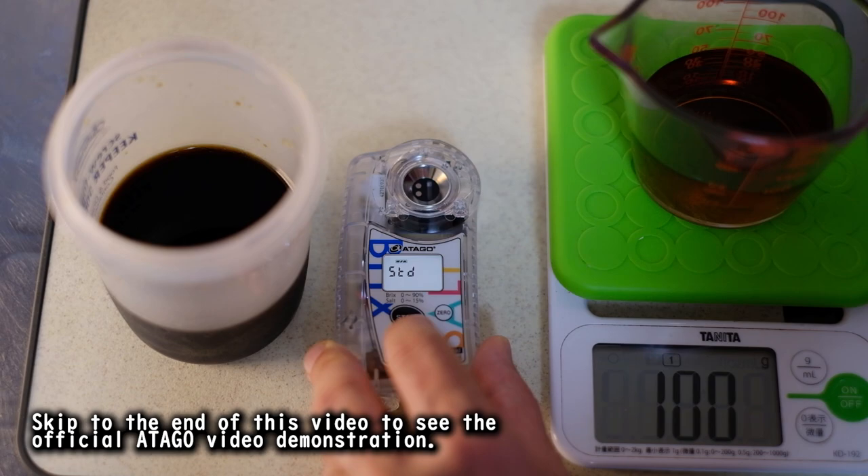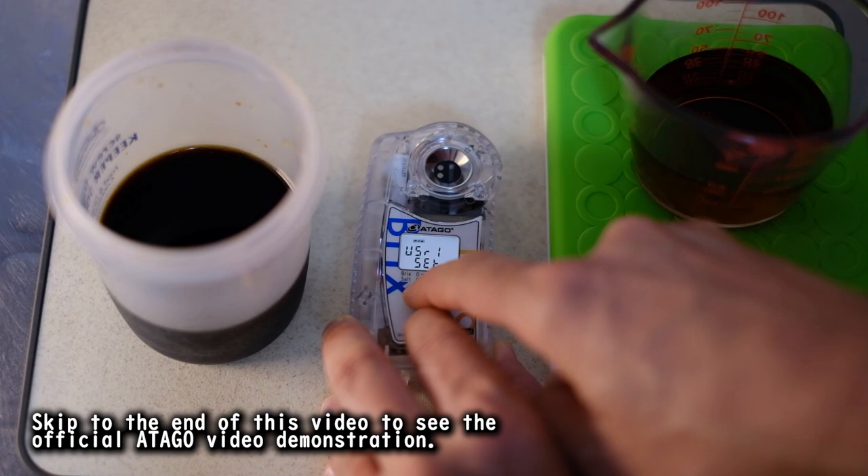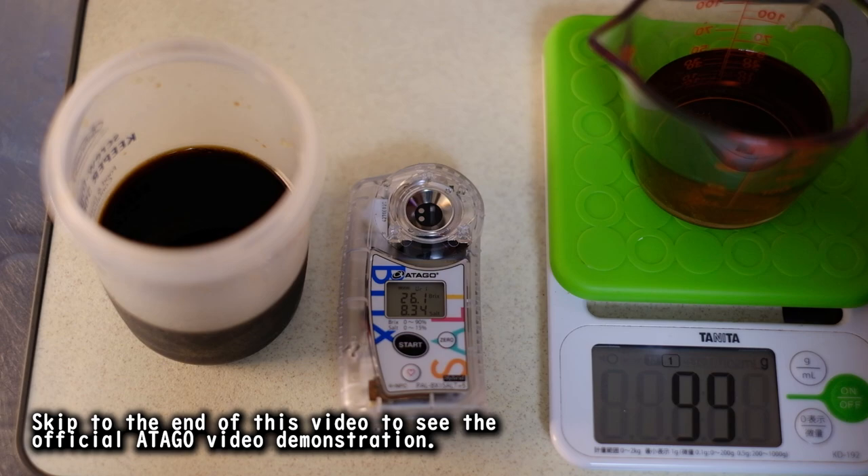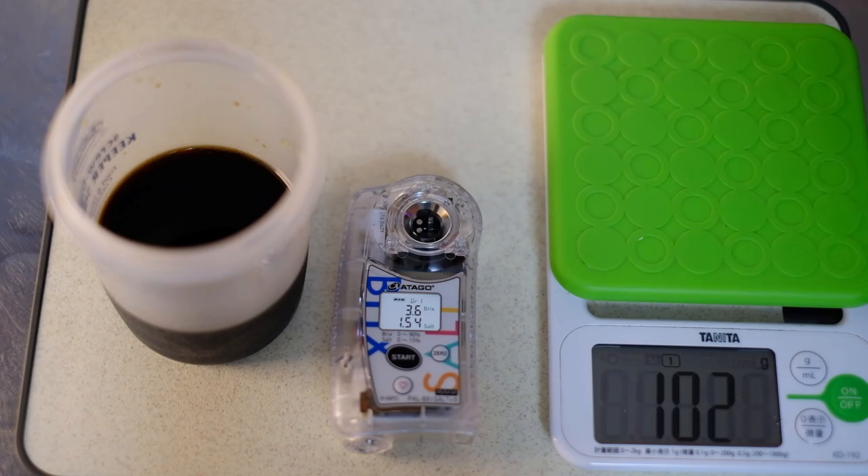Next time I make a batch of Ramen at Home's official shoyu tare, I can test it out with just a couple of drops. If you're interested in seeing exactly how you do this and a bit more about this unit, I'll link to the Atago website down below. They have a nice 5- or 6-minute long video that really goes through all the details.